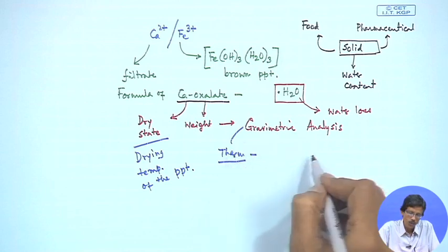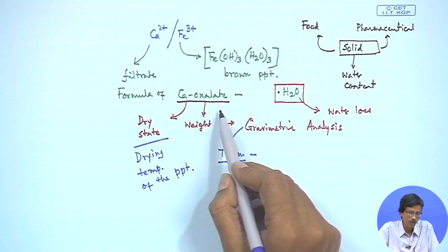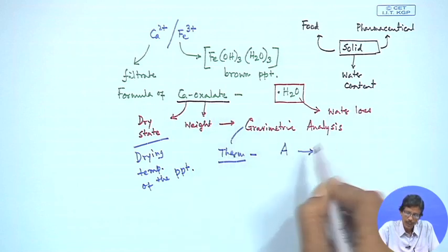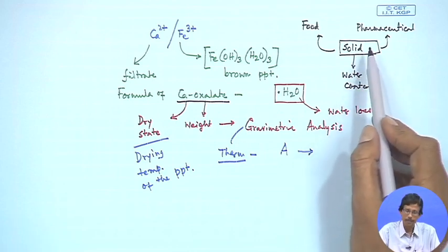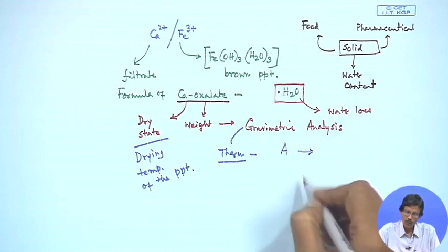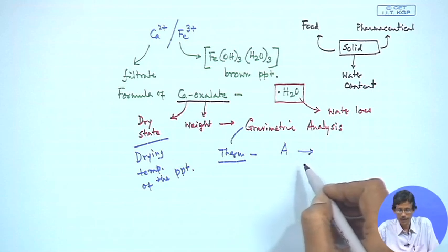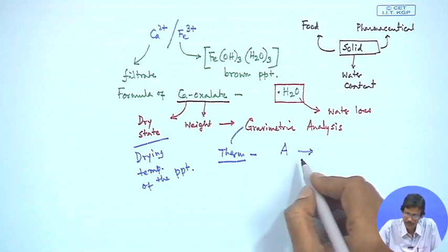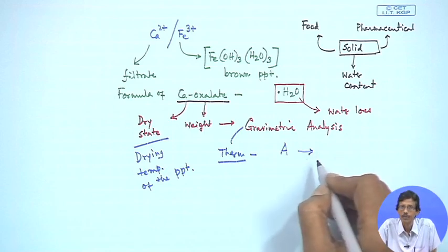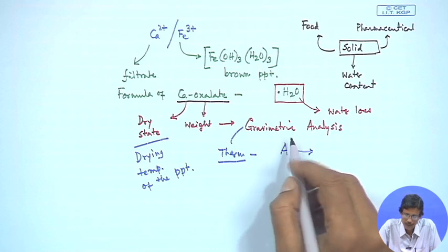So, that particular profile can also give you the species, that means the thermal stability of the calcium oxalate. So, any other thing, any polymeric sample, any cement sample, any ore or any solid or pharmaceutical sample, we should know its corresponding thermal stability, because we have to keep that particular sample at a particular temperature. If it is unstable at room temperature or at a little bit higher temperature than our room temperature, we have to be very much careful about its thermal stability.